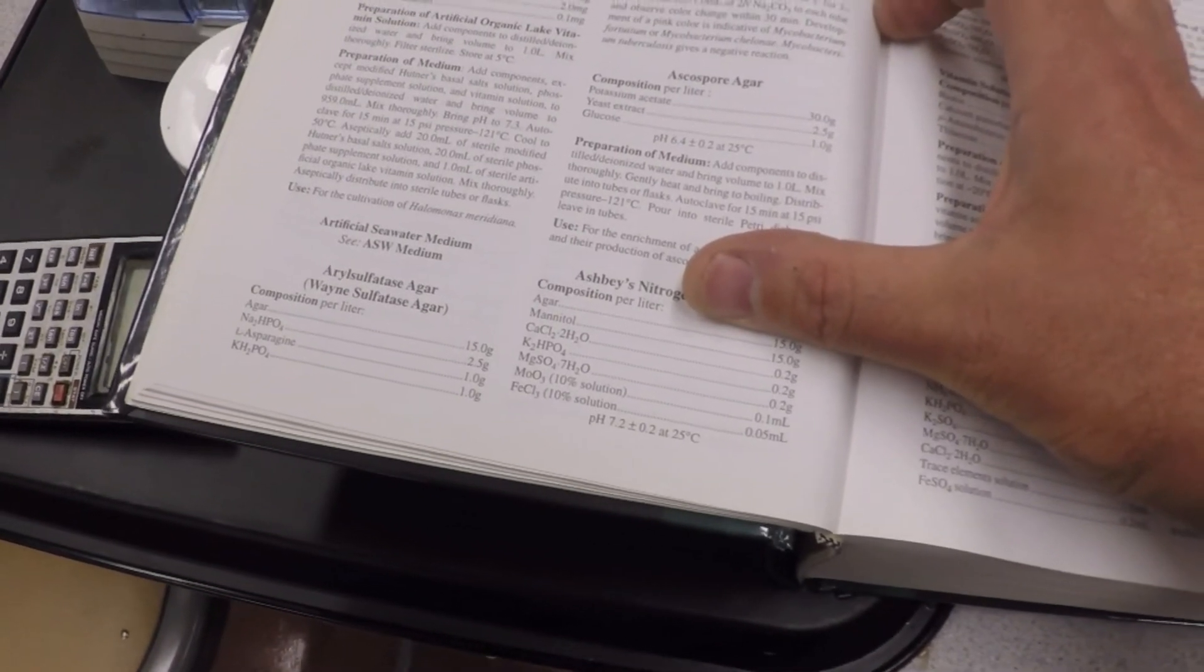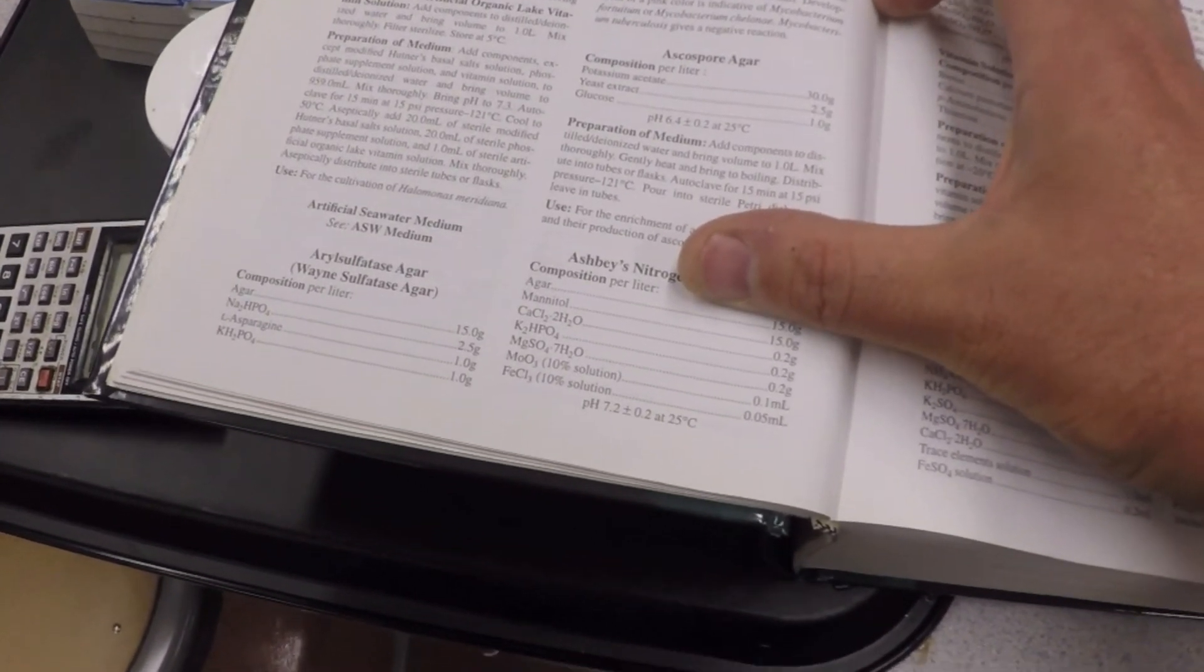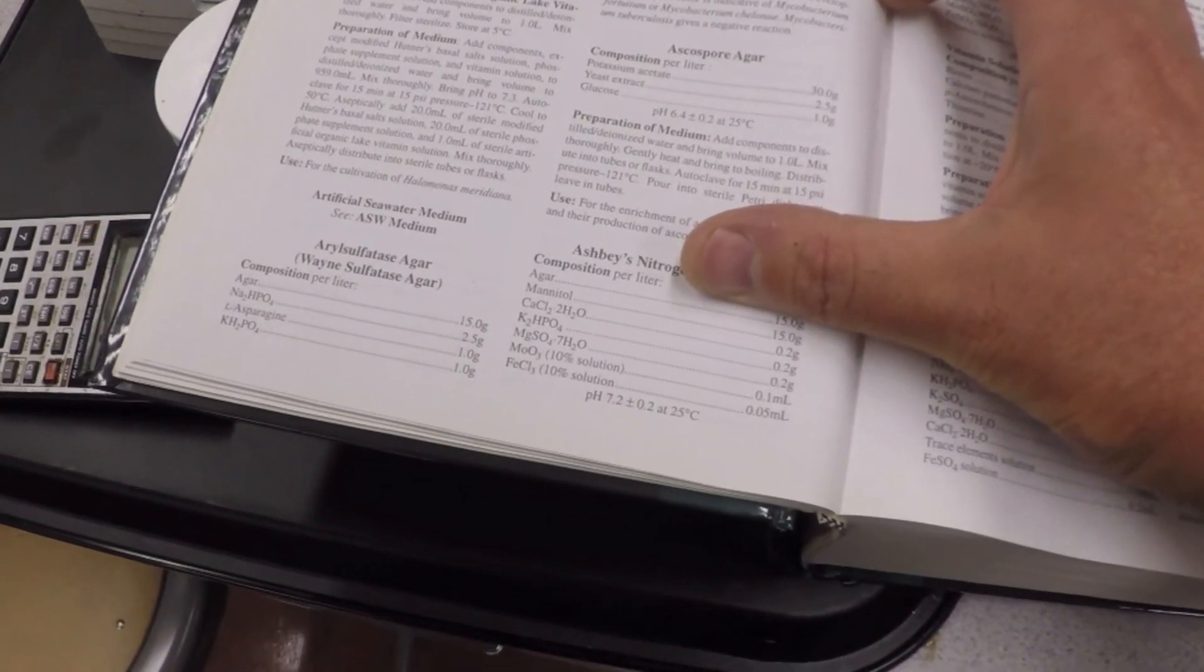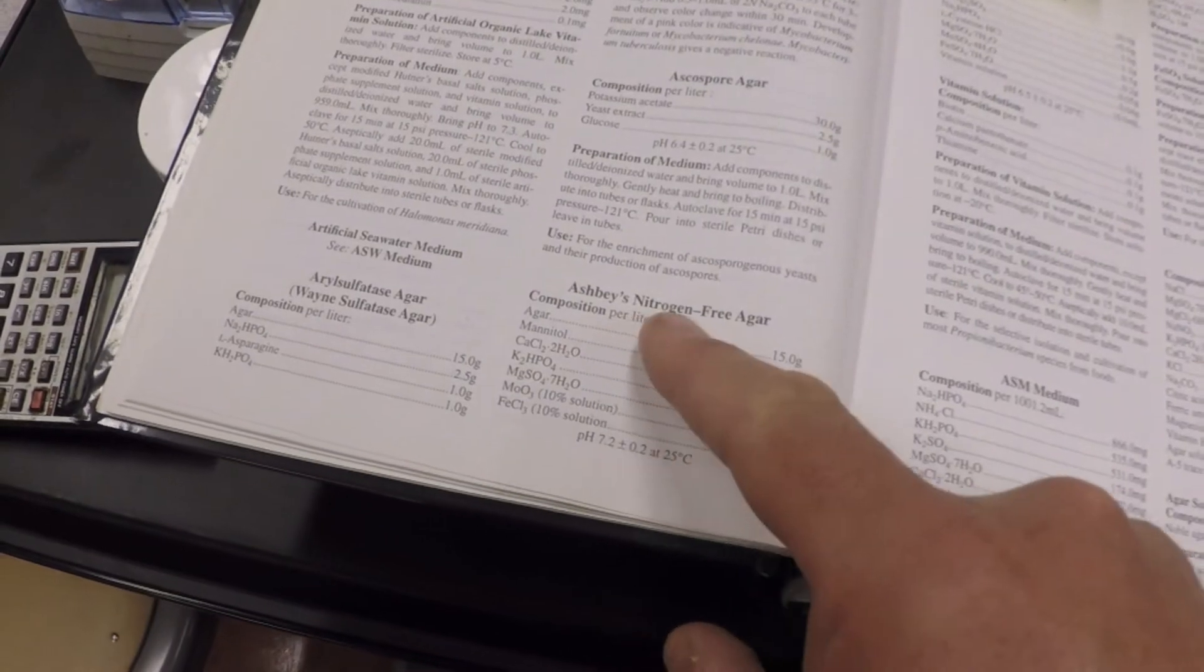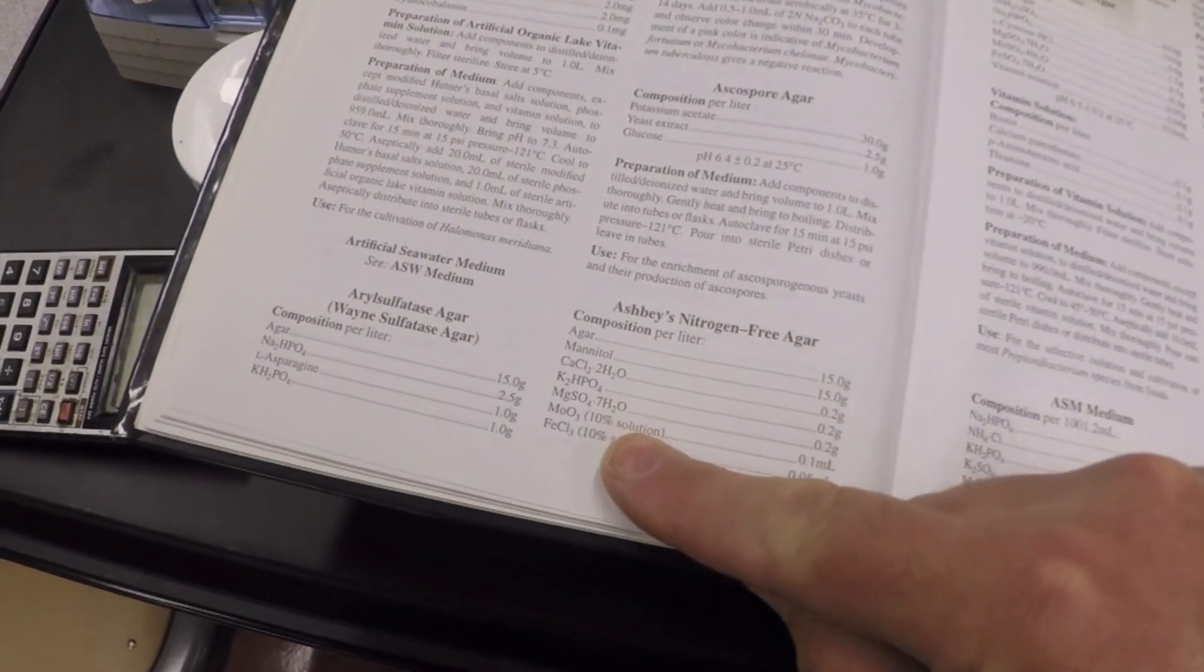Well, if you looked before my thumb was there, and if you listened to what I said, you'd know that azotobacter is a free-living nitrogen fixer. So this is nitrogen-free. Notice nowhere in here is there any nitrogen.